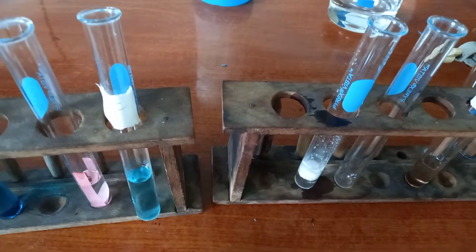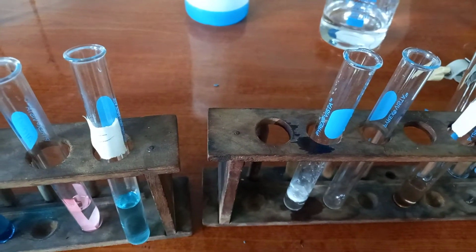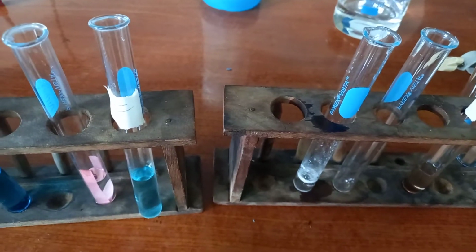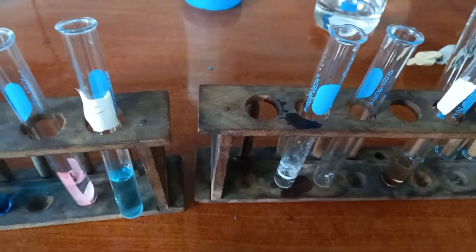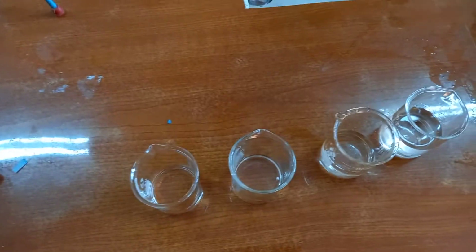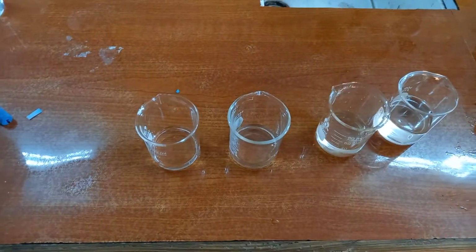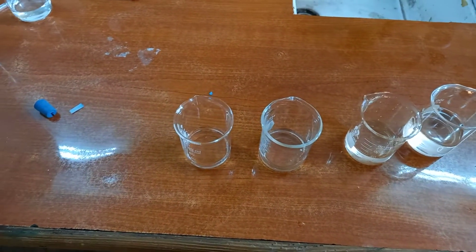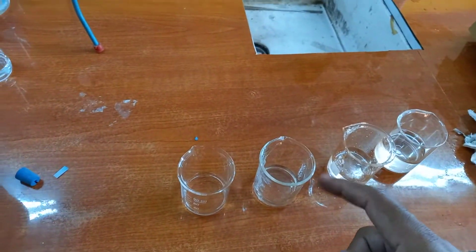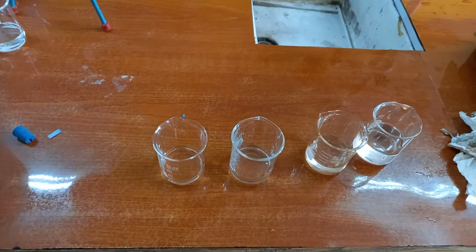And as you can see, it fizzed. So I'm going to compare this same reaction with ethanoic acid, which we know, so not the one we have prepared. And I'm going to do it with formaldehyde and compare them. Here I have 4 containers with pure samples or confirmed samples. This is alcohol, ketone, aldehyde, and carboxylic acid.